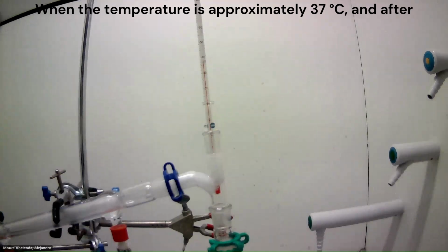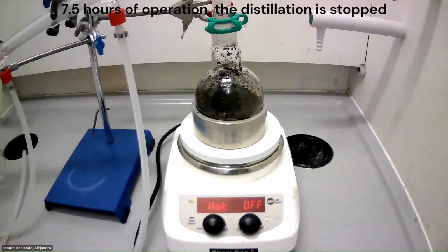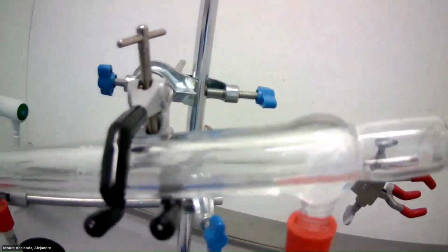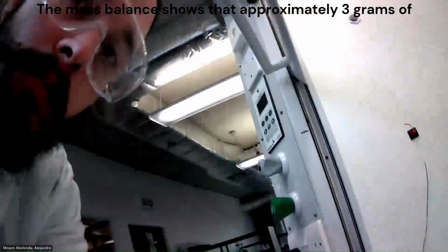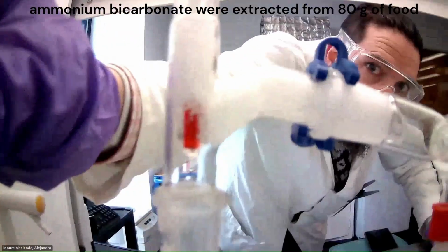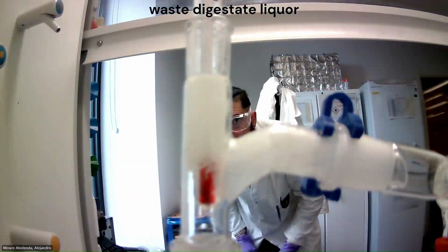When the temperature is approximately 37 degrees Celsius and after 7.5 hours of operation, the distillation is stopped. The mass balance shows that approximately 3 grams of ammonium bicarbonate were extracted from 80 grams of food waste digestate liquor.